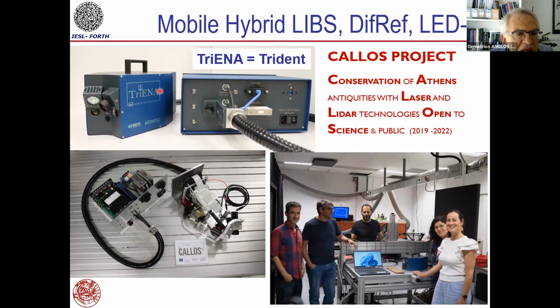Removing the dressing from those instruments, you can see the inner part, both of the probe head and the spectrometer and control unit. You see it also in the lab, along with those people in the lab who actually contributed and were responsible for this engineering and development project that was funded by a project we had with the archaeological authorities in Athens.